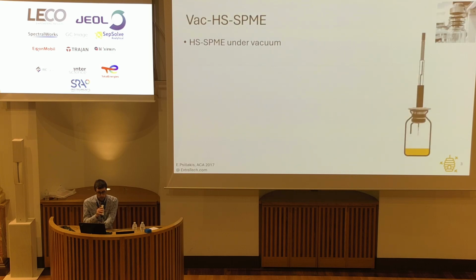Regarding the sample preparation, we are using vacuum-assisted SPME. So it's the regular headspace-SPME that is well known, but for which we put the vial under vacuum. The effect of the vacuum is to decrease the resistance to the mass transfer in the gas phase film.